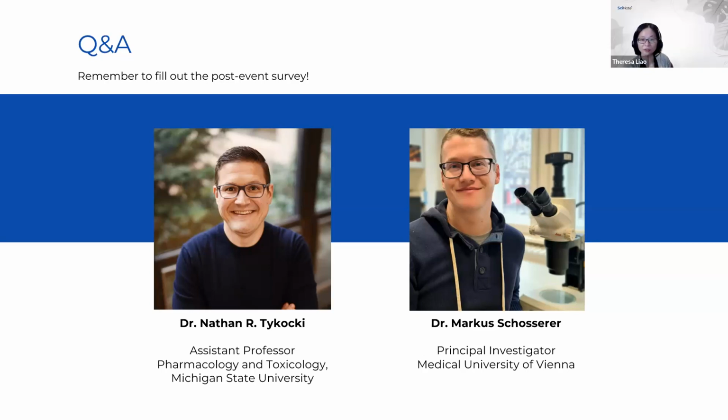So Nathan, do you have anything to add for how you handle that? Yeah, for us right now, they're handled completely separately. Our physical inventory in the whole lab and the use of SciNote are independent. So that idea of connecting the two at some point in the future is super. We haven't run into any issues with having it as such, but they're just two separate entities to us.